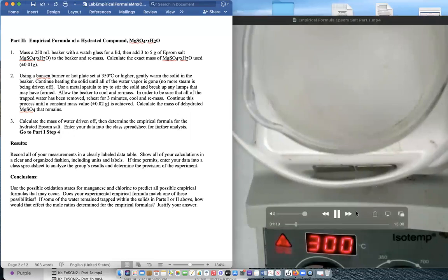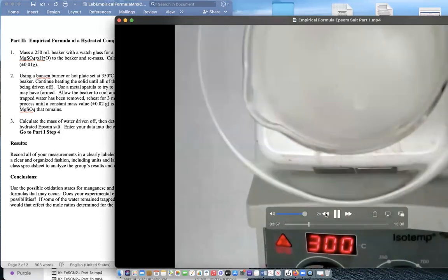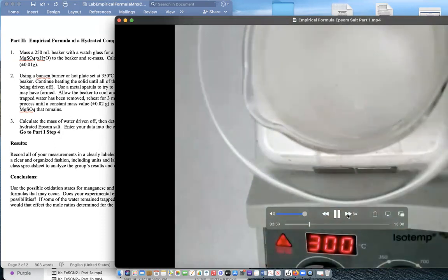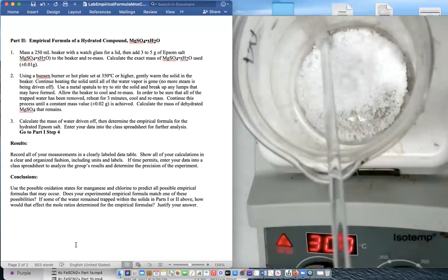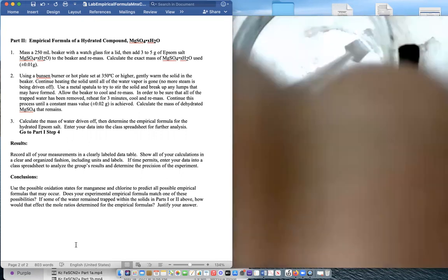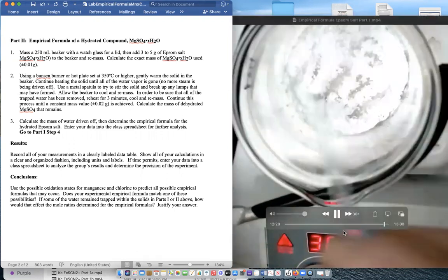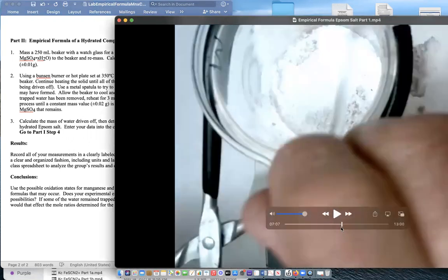If I speed this up a little bit, I'll go at 30 times, I don't want to go too crazy here. So bump that up to increasing at a rate of 30 times for the reaction. You will see that it will continue to look wet as that moisture's leaving. I'm trying to break that up with a stirring rod, but after a while it starts to stick, sort of like concrete. And you have to go back and break it up again.